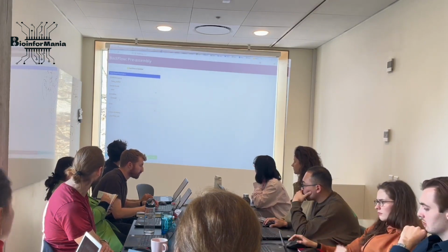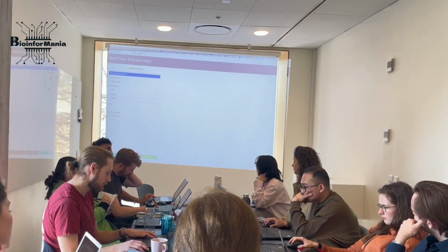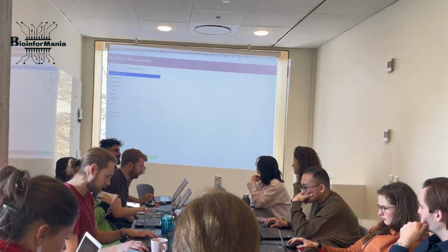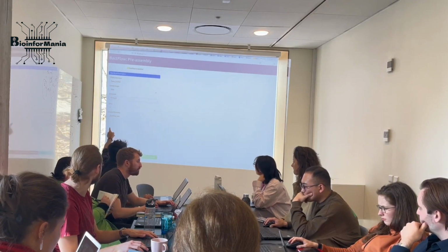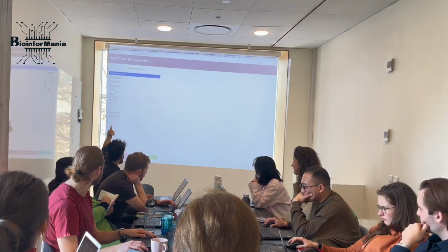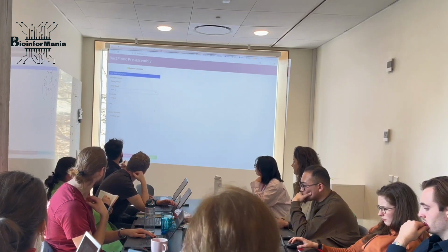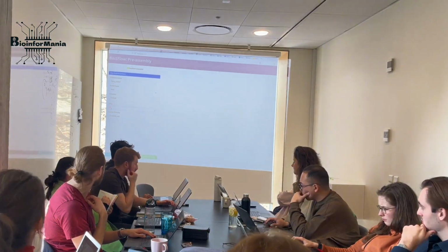And also you need to give the extension that those files carry. In most cases, it's called fastq.gz in Oxford Nanopore Technologies outputs. Okay? But in this case, I have already concatenated it. If you don't do this and you set it to true, it will concatenate it for you. Okay? Quite cool. And then we give the number of CPUs.